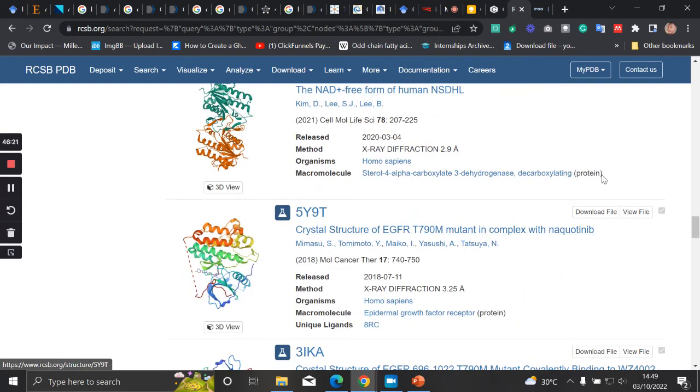Okay, now I was talking about missing residues earlier. When we see something like this in the structure of a protein, I hope we can all see that, these lines that are right here are broken lines. They represent missing amino acid residues. So selecting these is a very bad thing. We can see the resolution score as well, that it is 3.25, which is very high. So this is not a good structure.